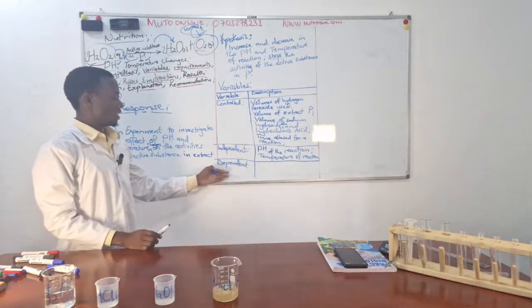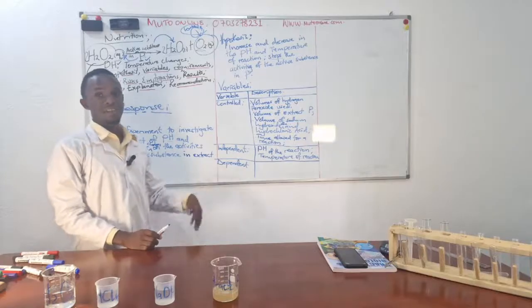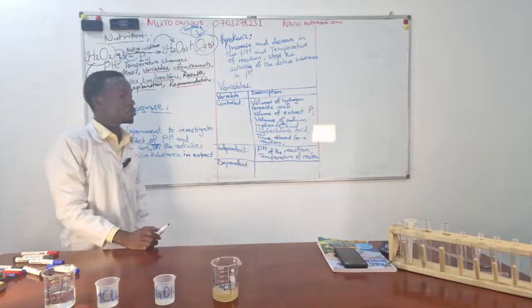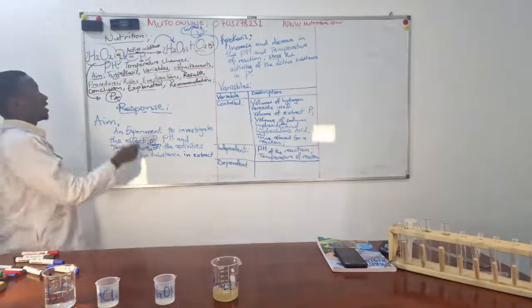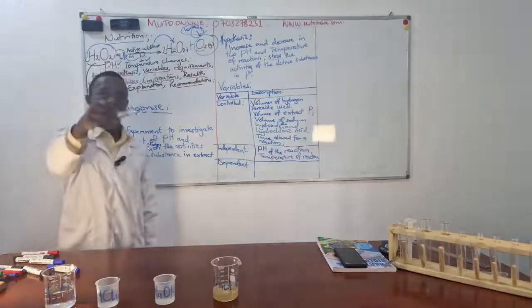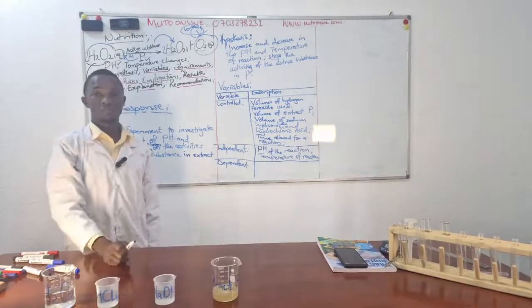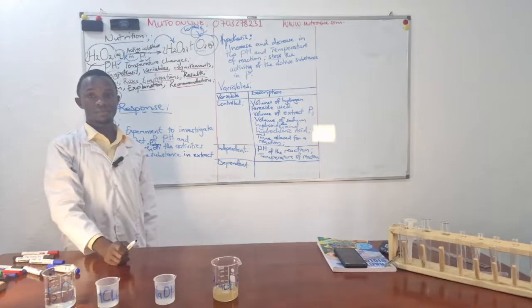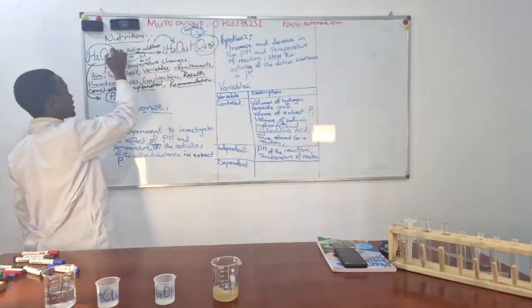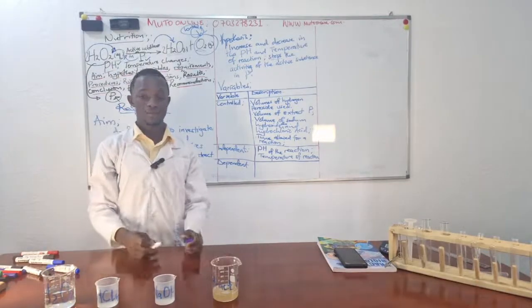Great. So the dependent variable, we say, are the results of the investigation. To repeat for you, due to the sound loss, this hydrogen peroxide is among the toxic wastes that the body forms during metabolism. Being toxic to cells, the body always does its best to eliminate it.